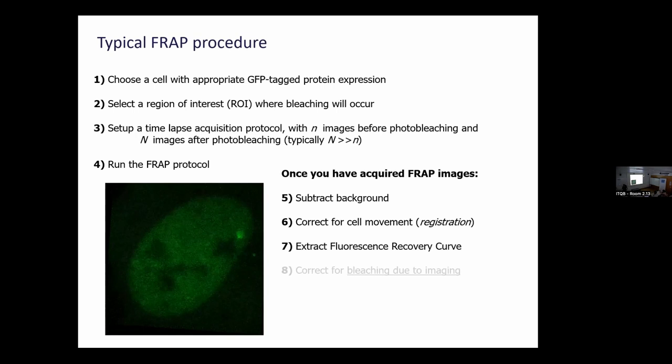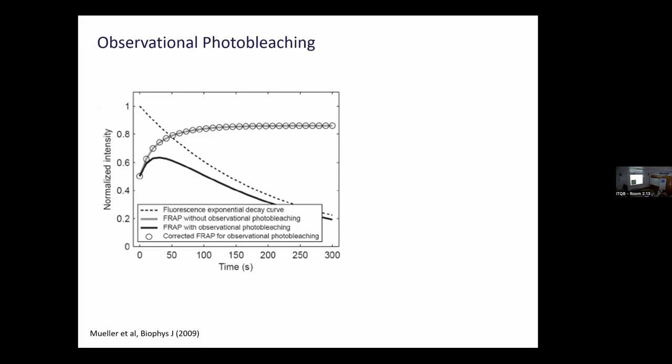Okay, I'm just going to give a little bit more detail for those of you that actually want to do FRAP. I highly encourage you to. It's really easy. Also the data extraction. The one thing you need to do, because as you can also see a little bit in this image, even if you use a very low transmission of the laser, you still have a little bit of photobleaching during the subsequent step of imaging. Maybe it's just 10% if you image for a few seconds, but it's there.